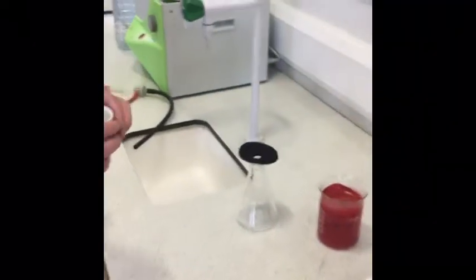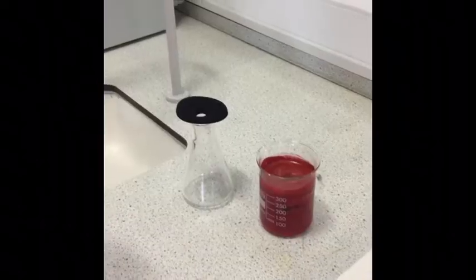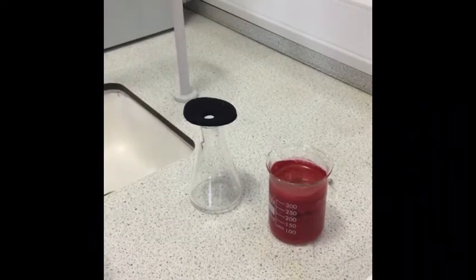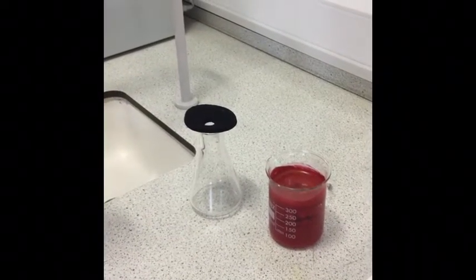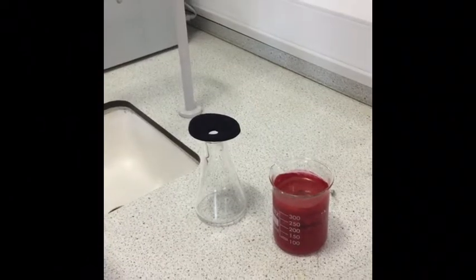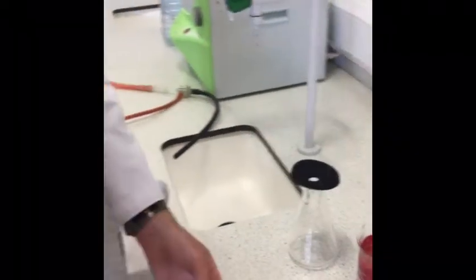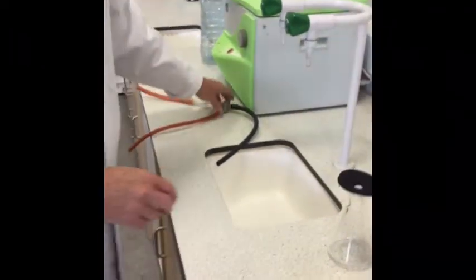Okay, right, now what we want to do is to filter off the precipitate into the Buchner flask and the Buchner funnel. We use this because just doing a normal filtration the way you did in National 5 or Higher would take a very long time. So this time we're going to use a bit of a water pump to produce a vacuum.